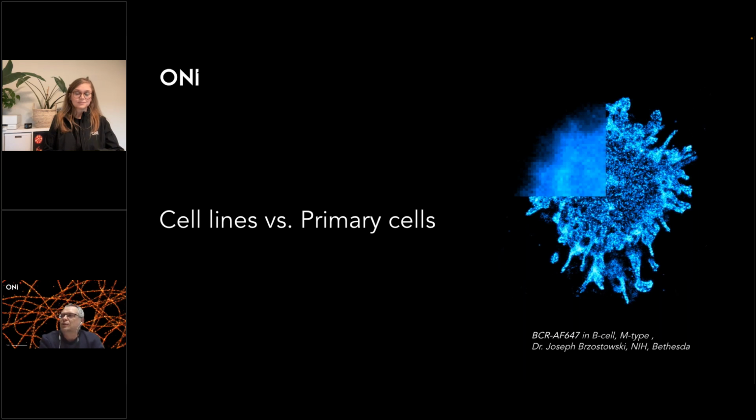However, if you are interested in activating your T cell receptor, let's say in primary T cells, then you can use antibody-coated surfaces. Usually it will be anti-CD3, which will bind the CD3 protein on the surface of the T cells, and that will adhere the cells to the bottom. You can use that as an activated surface. Here you will look for a reorganization, for example, of your protein on the activated surface, not on the non-activated.